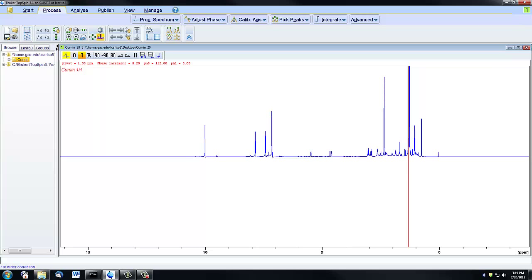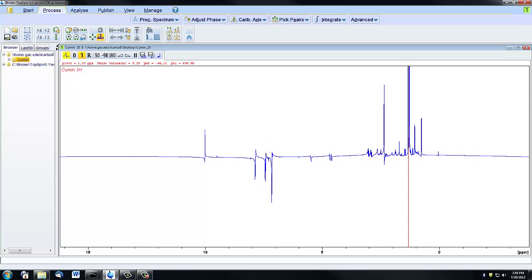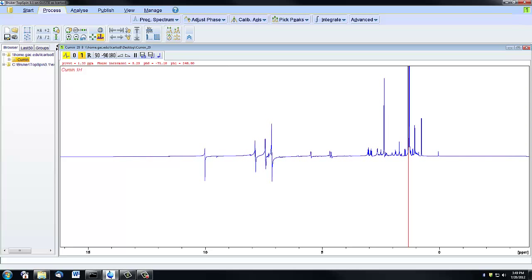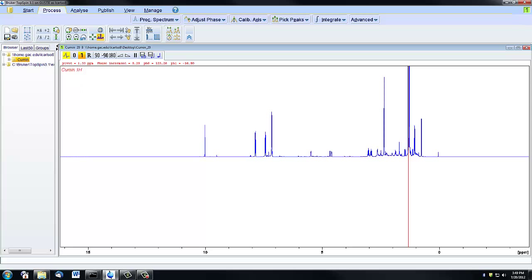The first order correction is going to even out the baseline to the far left of the red line. You'll see if I move it now, the spectrum is changing on the left side of the screen. Again, you're going to want to try to level out your baseline.